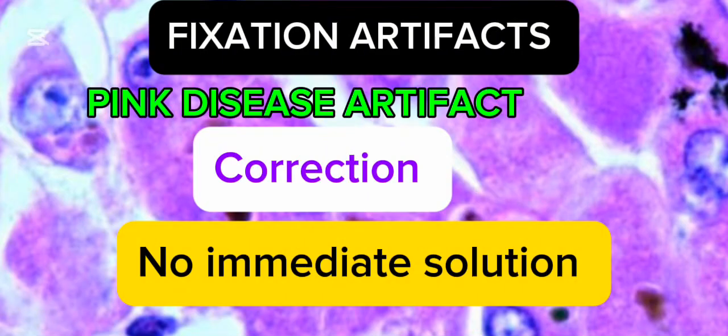1, we must appreciate that pink disease artifacts cannot be removed once they form. So why? Because they are formed as a result of structural changes in tissues that cannot be reversed. So the only solution is prevention through proper fixation techniques.